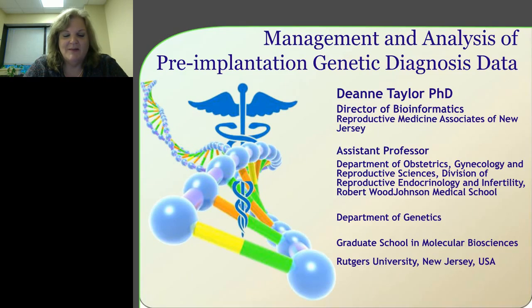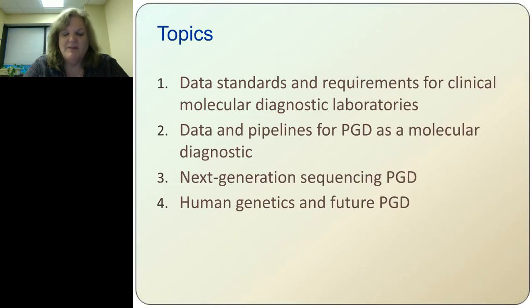So I want to talk a little bit about topics in managing data for clinical laboratories. So my topics are going to be data standards and requirements for clinical molecular diagnostic laboratories, what exists now. I also would like to discuss data and pipelines for PGD as a molecular diagnostic. I'd like to talk about next generation sequencing PGD and human genetics and future pre-implantation genetic diagnosis trends.